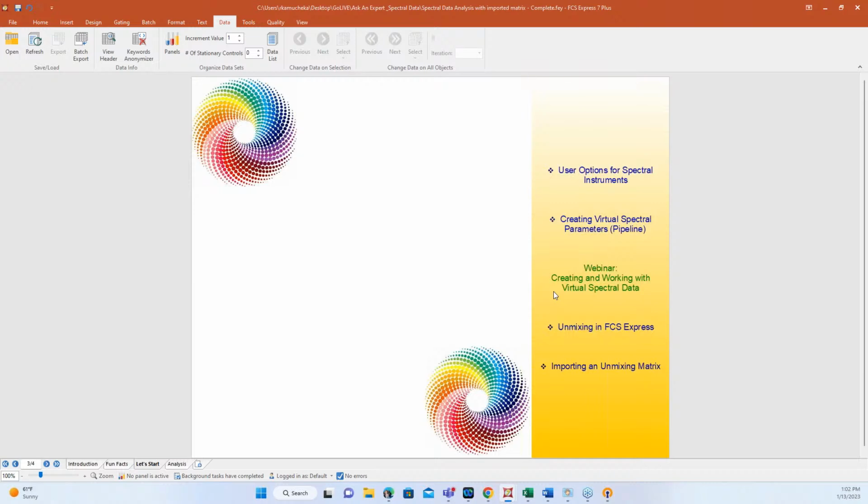Absolutely. So if you're just seeing your scatter parameters, forward scatter and side scatter with a Cytek data file, that's a raw data file, you know it's likely that box. Just uncheck that box and then refresh your data. On the data tab, there is this option to refresh. This is probably one of my favorite new implementations in 7, that we have the ability to just refresh our data. It will reload it and make sure that you can then see all of those channels.